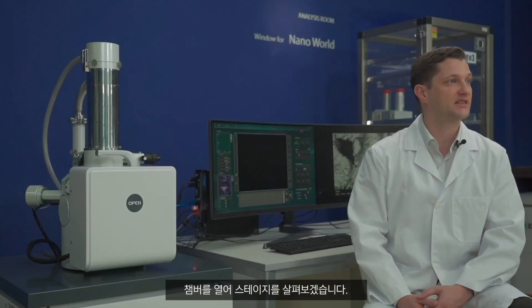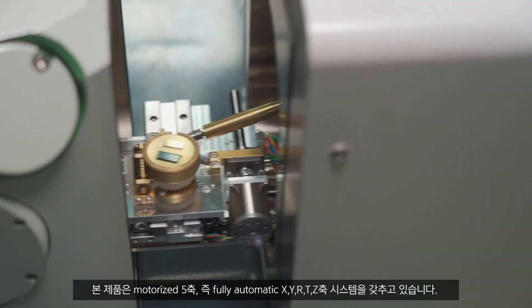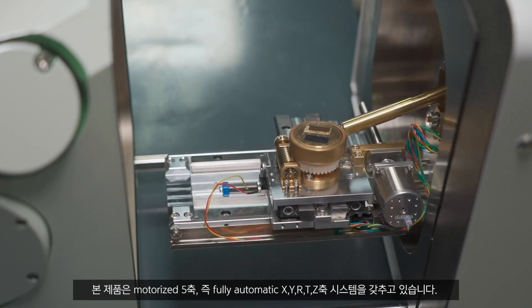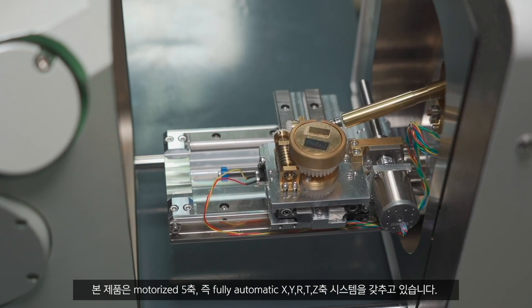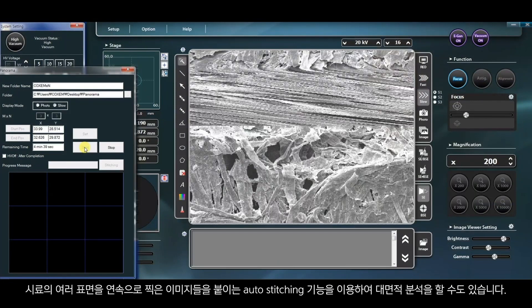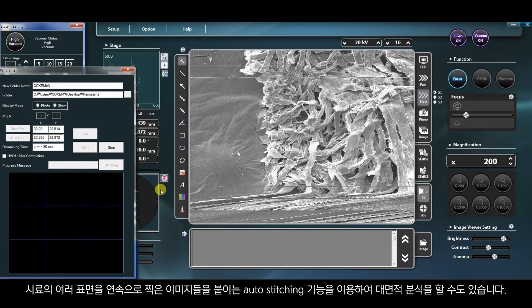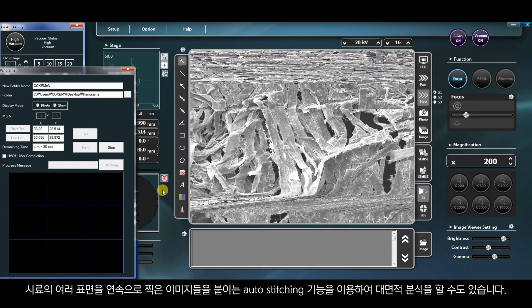Let's open the chamber and take a look at the stage. This product is equipped with five motorized axes: the fully automatic X, Y, R, T, and Z axis systems. This product also offers an auto-stitching function that scans different parts of the specimen surface continuously and stitches them together automatically, enabling the analysis of a large surface area.